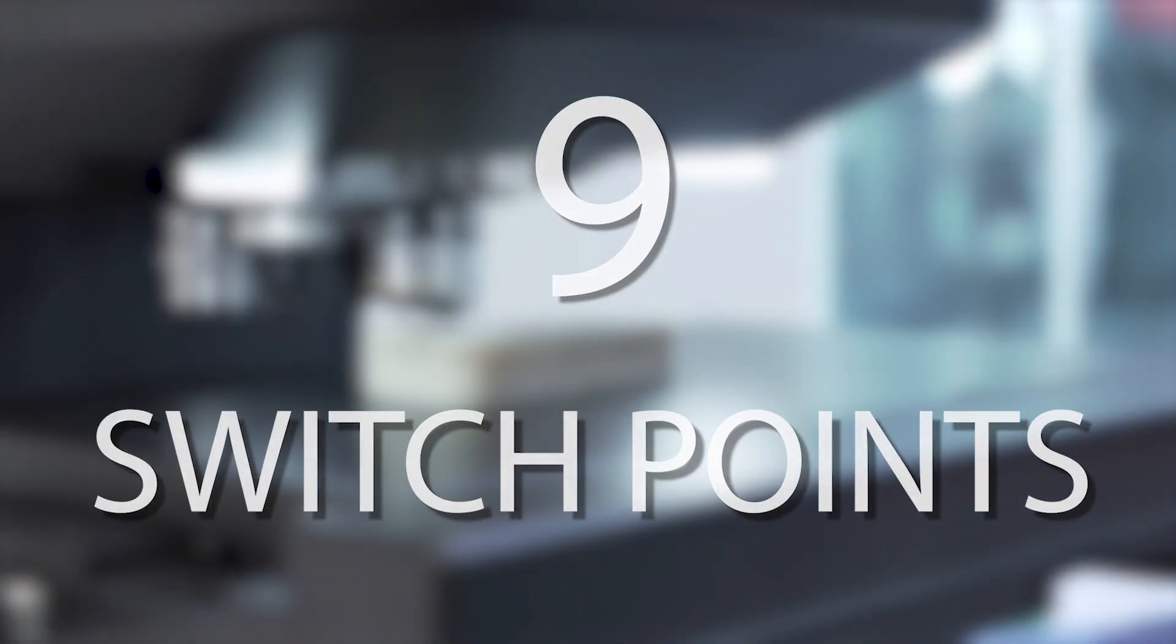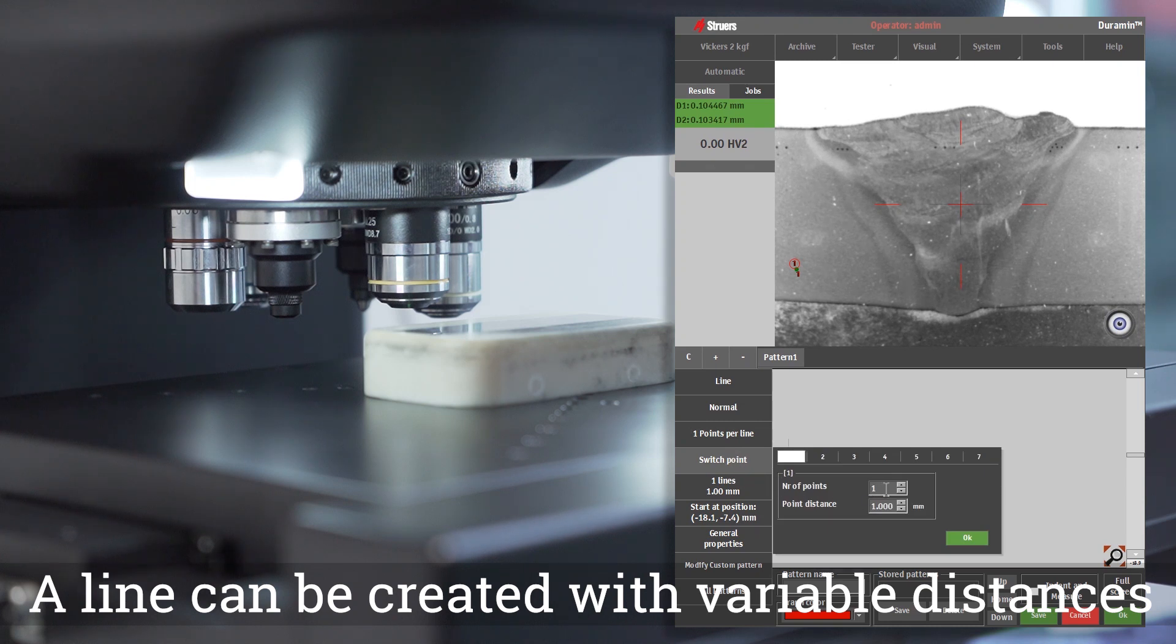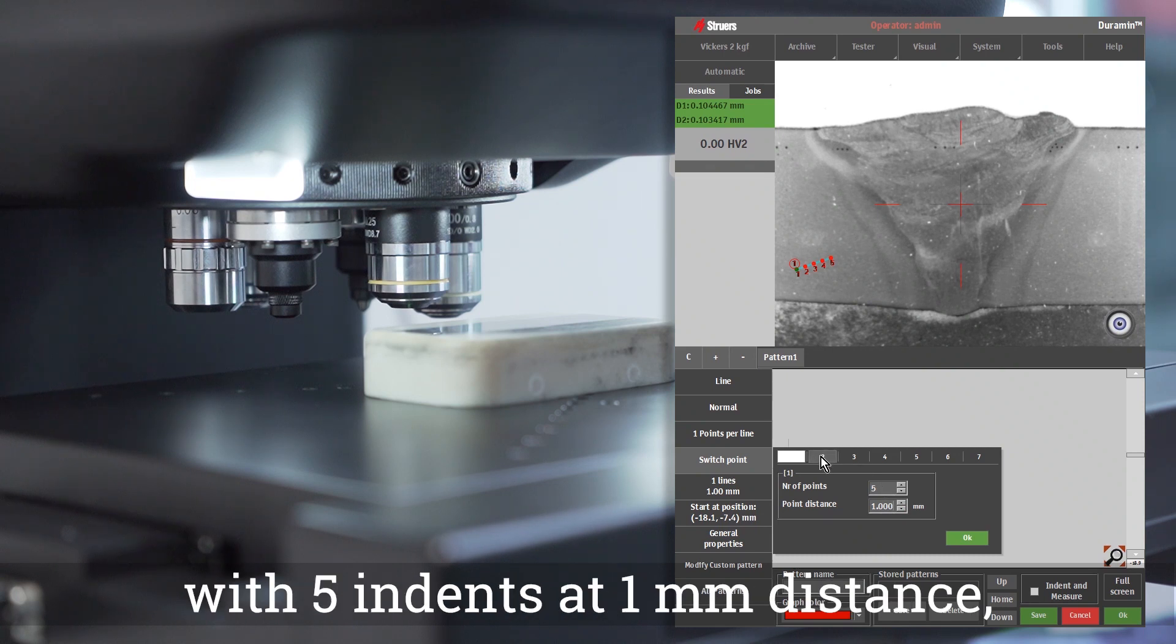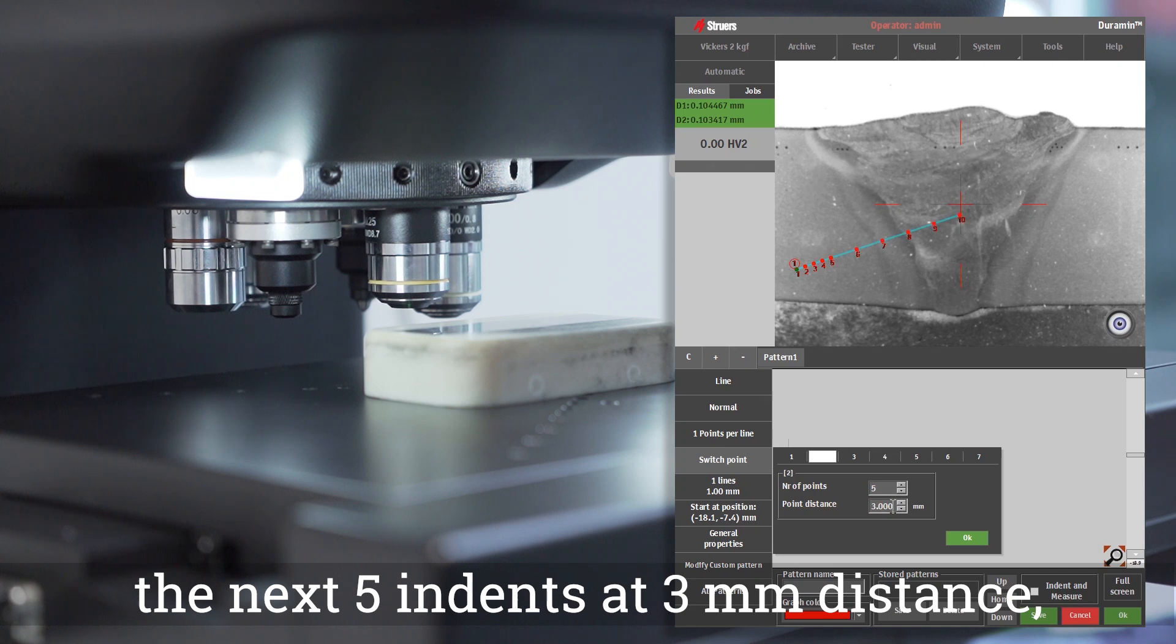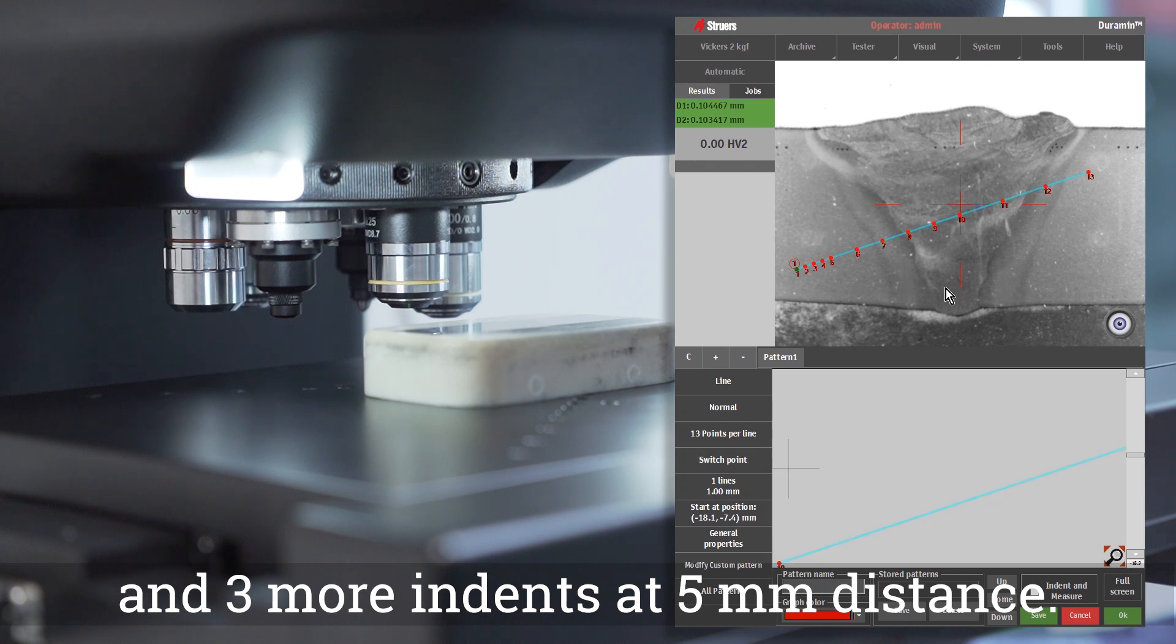Switch Points. A line can be created with variable distances between indents. For example, we want a line with five indents at one millimeter distance, the next five indents at three millimeter distance, and three more indents at five millimeter distance.